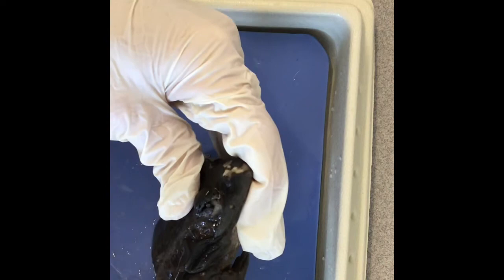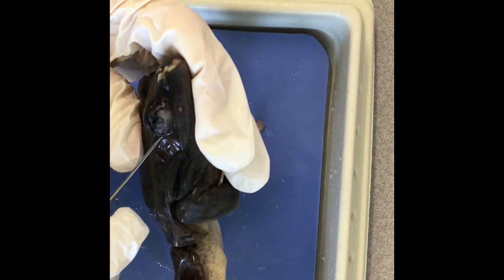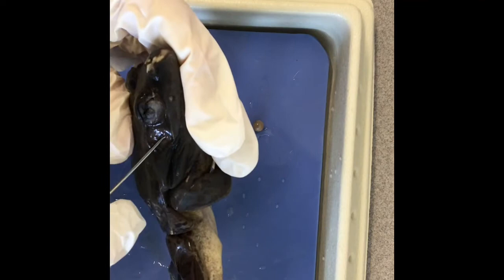On the outside of the frog, we have the tympanic membrane, which is right here. It's circular. It's essentially the same thing as our ear, but it doesn't have the external flap the way we do. It is used for the frog to hear.